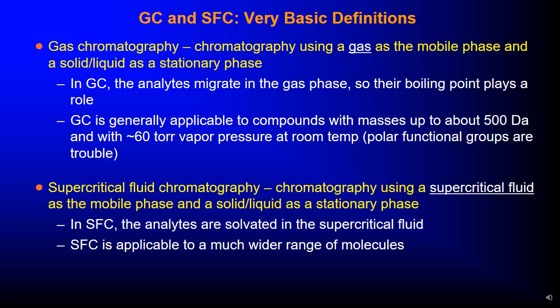So that means that polar functional groups are trouble. Majorly, there is always a problem that arises due to polar functional groups, as we will check later.